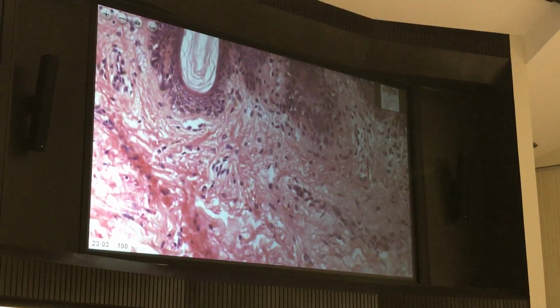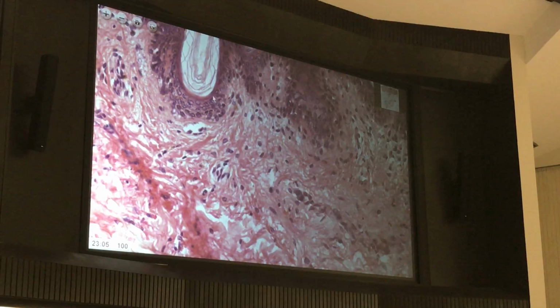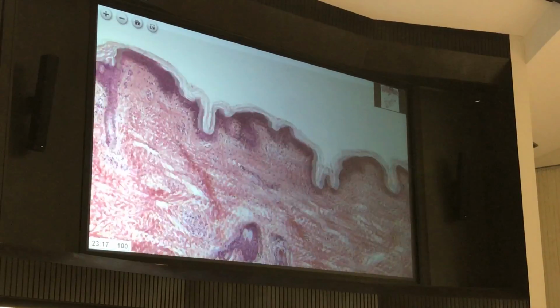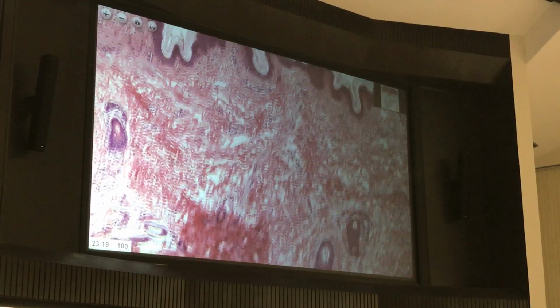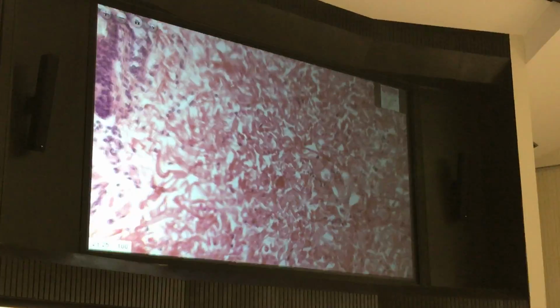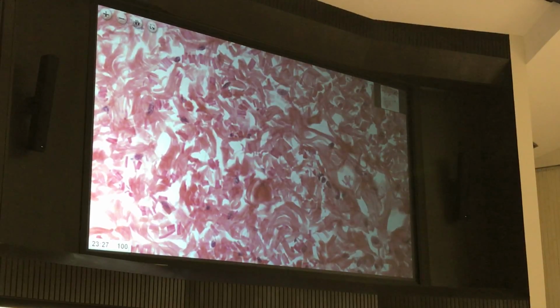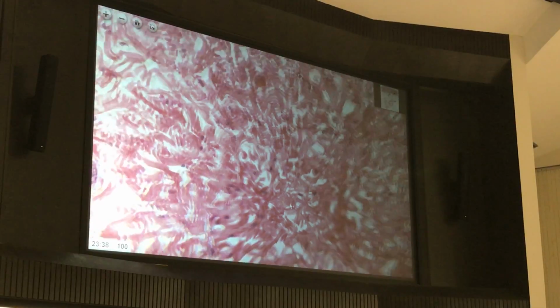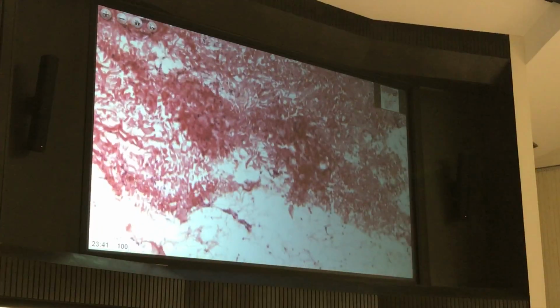So don't worry about the names, we'll do skin later, but if we're talking about skin, this is the epidermis, all the way to stratified squamous keratinized, and underneath is the dermis, and it's dense irregular. And that's what you can see, this is all dense irregular. And then making our way down, again, very thick layers of dense irregular. What would these cells be? These would be fibroblasts, and all of these would be collagen bundles. We'll look at one in a minute that's stained, because there are elastic fibers in here, we just can't see them. And then look at this tissue down here.